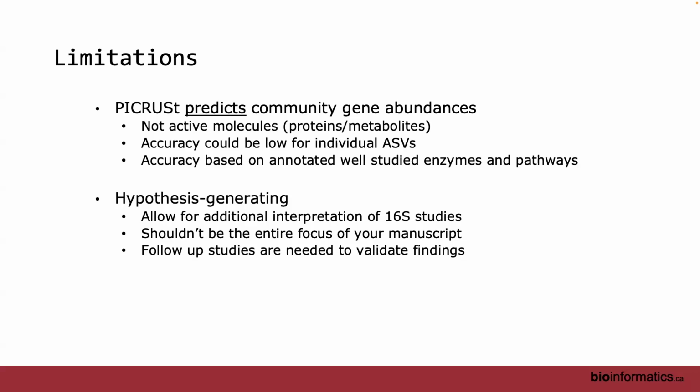No, I didn't know. Yeah, so all of the ASVs are included now in the prediction because they're all placed into the tree. But what if it's a novel microbe that isn't placed? Usually almost all of them are placed. It tells you when you're running it if any of them don't. You can set a different threshold of how close you want it to be, and you can also look in the output and see how close each ASV was.